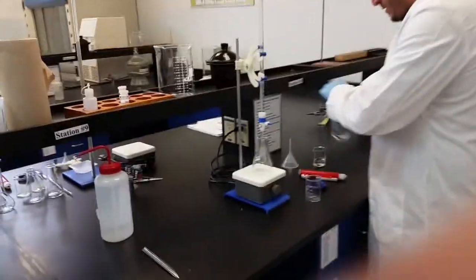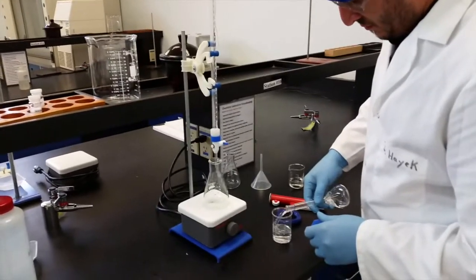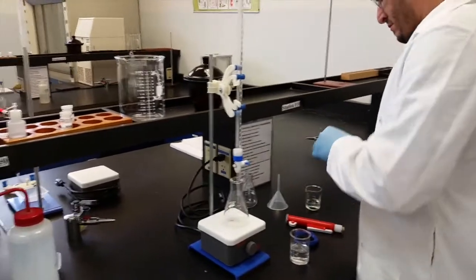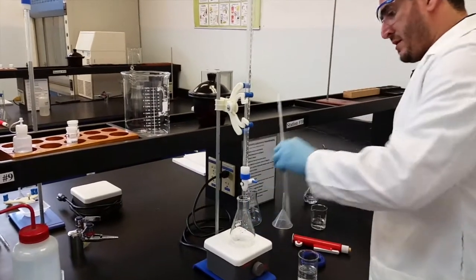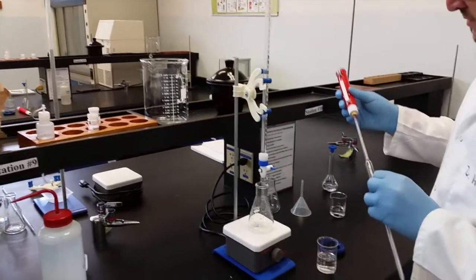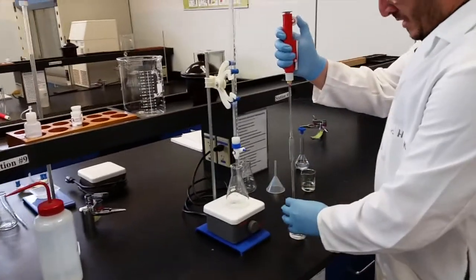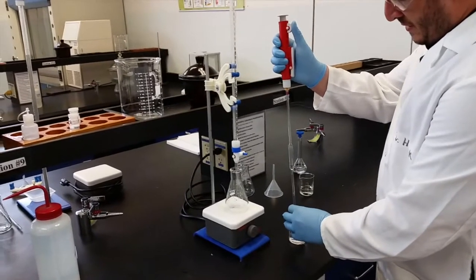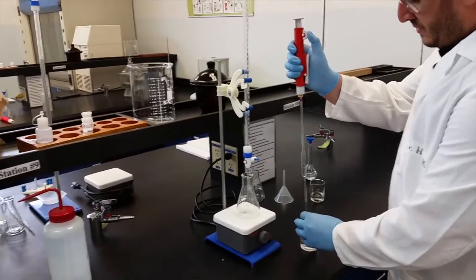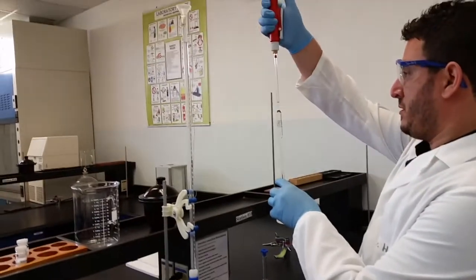Now with the other beaker, you take half of your solution. Then you will take the 10 milliliter volumetric pipette, attach it to the pump, and you will withdraw 10 milliliters of your solution.